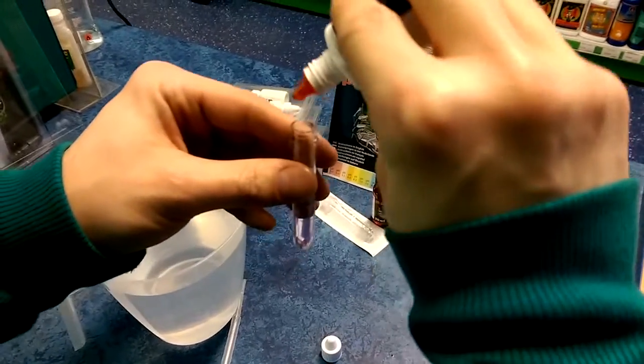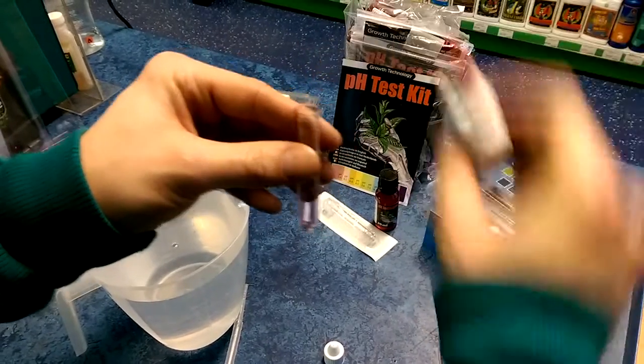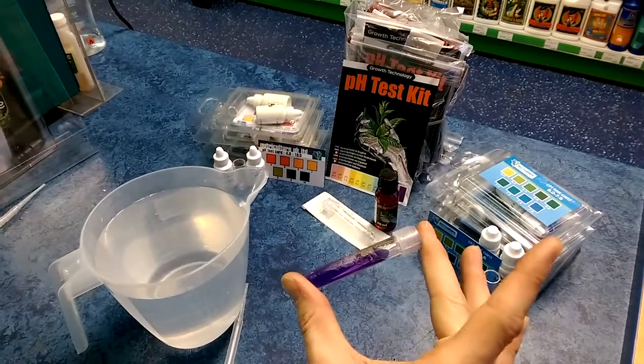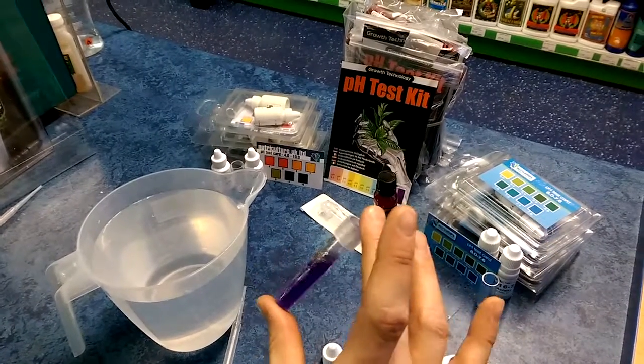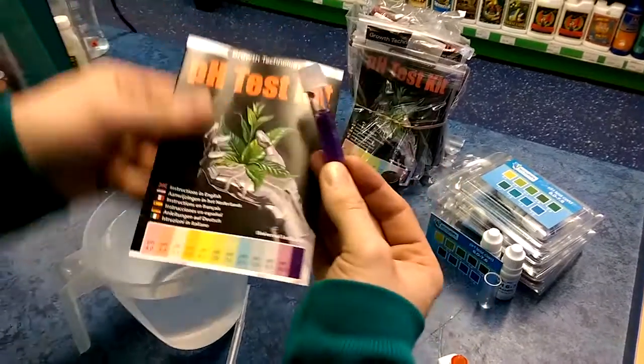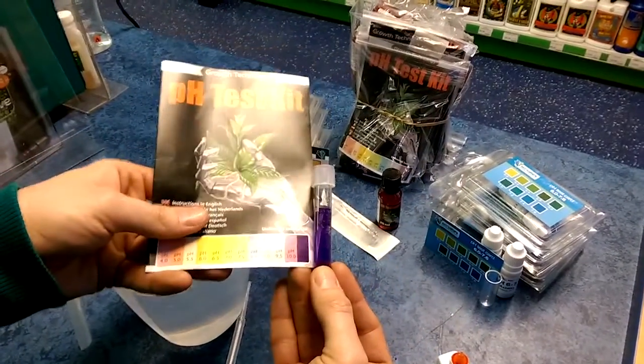Drop in the indicator as required. Drop it in there, then shake it up — and voila! Now obviously compared to the chart it is extremely high, so that is pH 11.